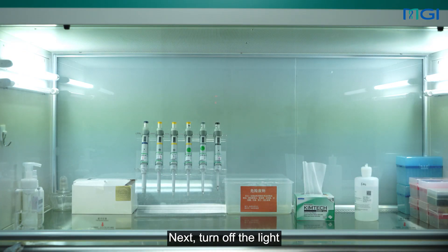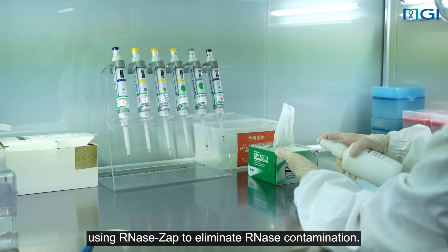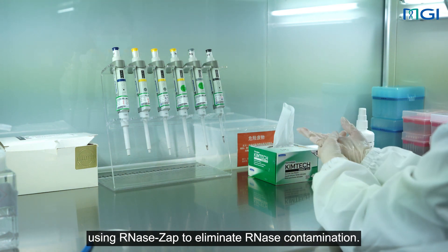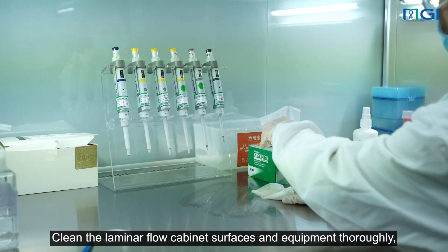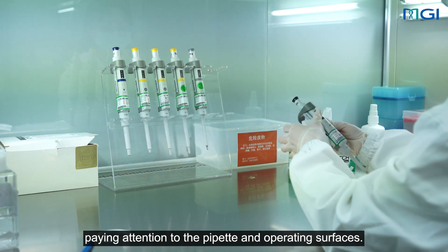Next, turn off the light and turn on the UV light for sterilizing for at least 15 minutes. Carefully wipe the gloves using ribonuclease zap to eliminate ribonuclease contamination. Clean the laminar flow cabinet surfaces and equipment thoroughly, paying attention to the pipette and operating surfaces.